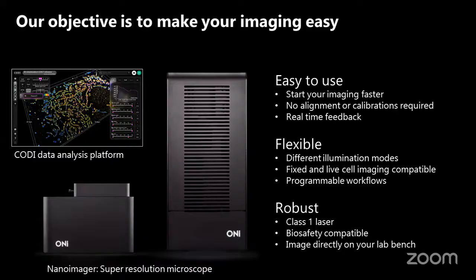And it is very flexible with illumination modes. People who work on SMLM use different modes like HiLo mode, TIRF mode, and so on and so forth. Here you can manually change the angle of the laser. It will help you to get your focus in a more flexible fashion.